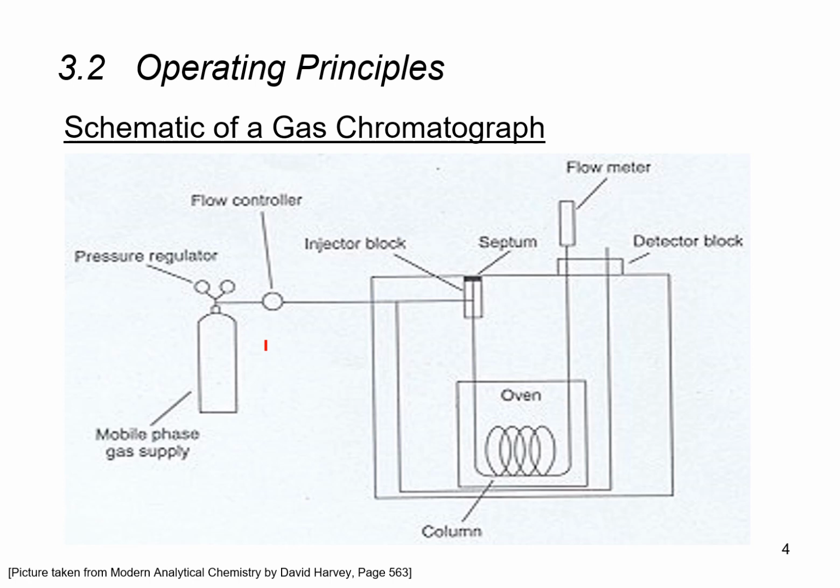So this gaseous system acts as the mobile phase, and its sole purpose is to push the sample through the instrument. Now typically the gas used here is some sort of an inert noble gas, so either helium or nitrogen gas, and again its main purpose is to carry the sample through the instrument. So it acts as the mobile phase.